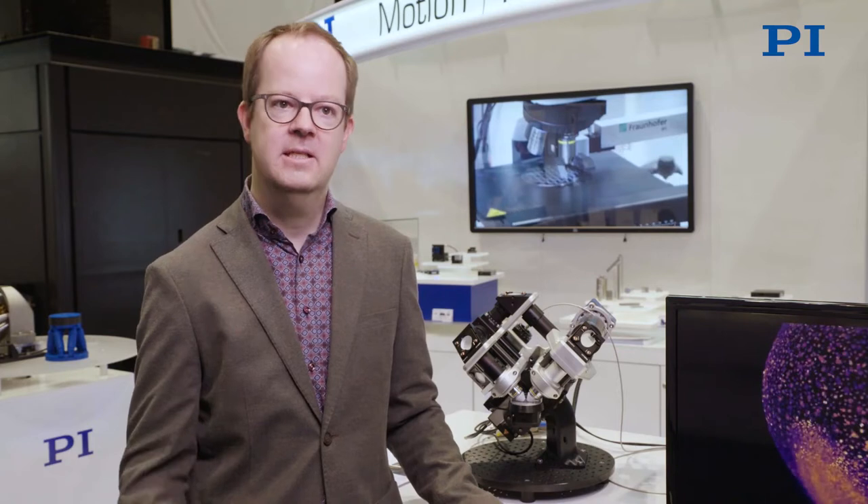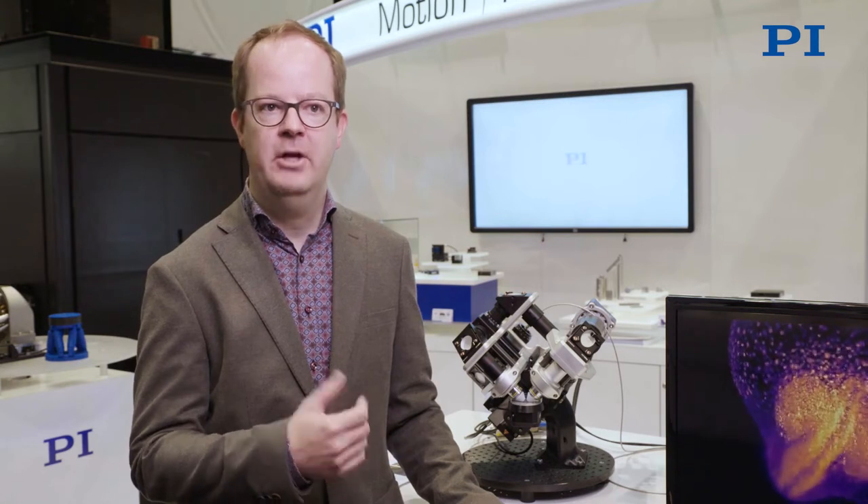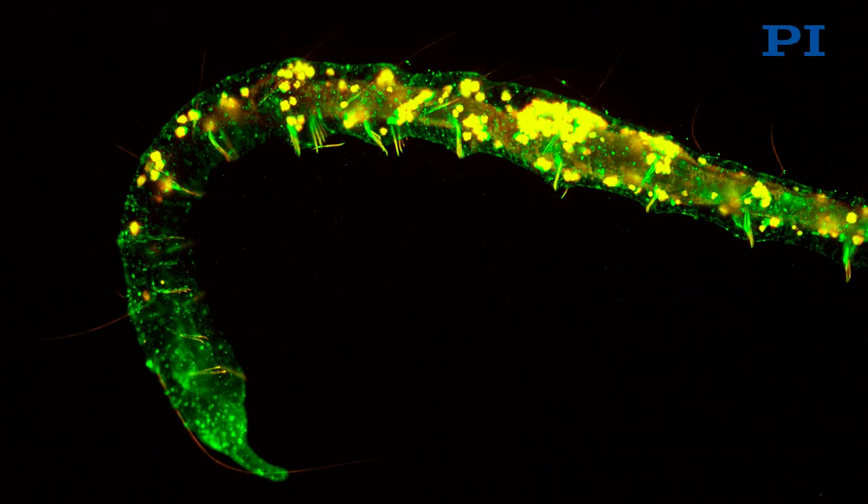The core technology behind the Flamingo microscope is light sheet microscopy. The idea is to illuminate the specimen from the side with a thin sheet of laser light, and that allows us to record very fast phenomena. So we can image the beating heart of a zebrafish, blood flow, or brain activity.